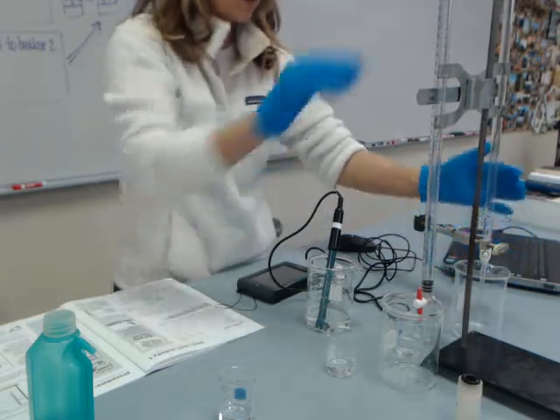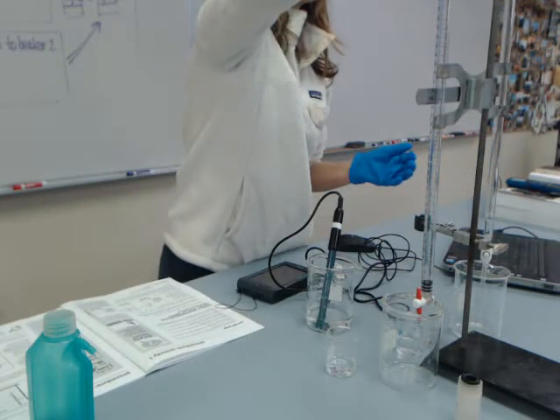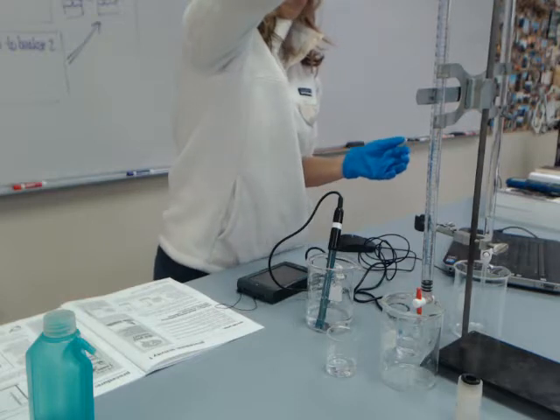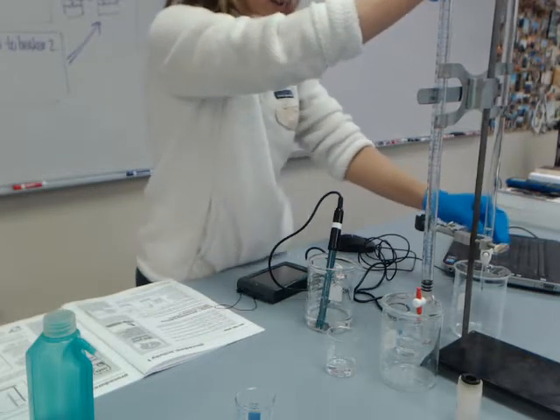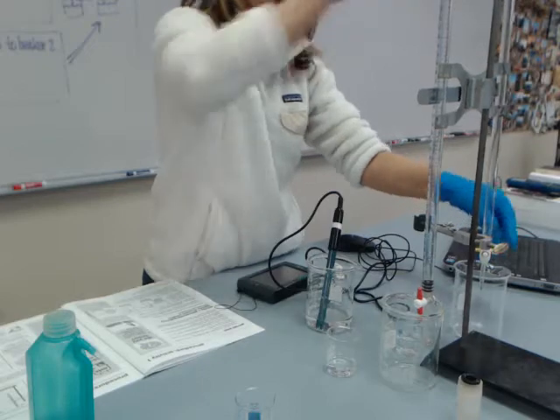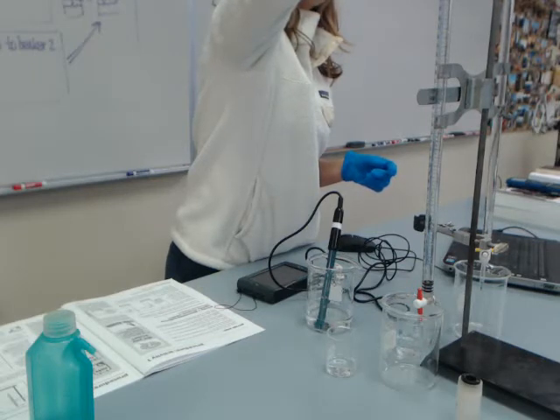Of course, it is not draining even though I just tested it. There was a little air bubble in it — there we go. So we're draining that out, rinsing out any impurities on the inside of the burette. I'm going to close the burette and then fill it. I made just enough — I only needed 10 mils, so that's why I only made 15 mils of the solution.